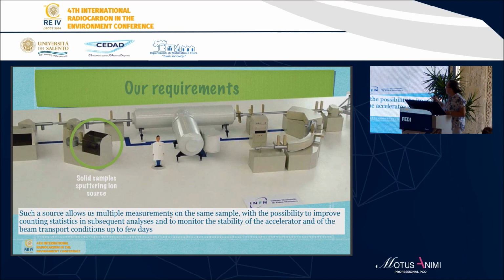In the sense that this source allows us to perform multiple measurements on the same sample. So we typically insert a sample, measure for a while, then go to the subsequent sample and go on, finish all the batch and start again.